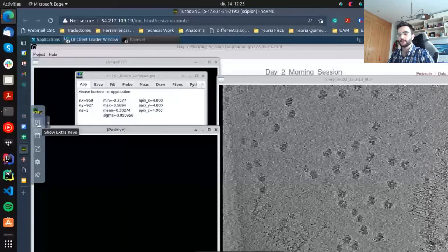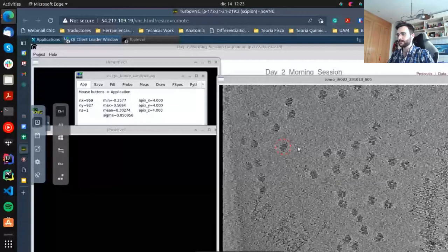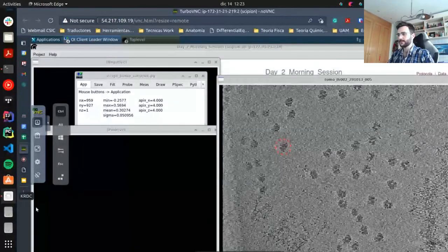Sorry, I was muted. Yeah, click on that icon. Okay, oh yeah, here, right? Yes, and then you click on control, and that is like pressing control. It's a bit annoying because from that point, your control key is pressed, so you just need to press the other key or do the mouse action. But then you need to click it to unpress the control. It's not very friendly, but it might help Mac users. Yeah, probably this will help.